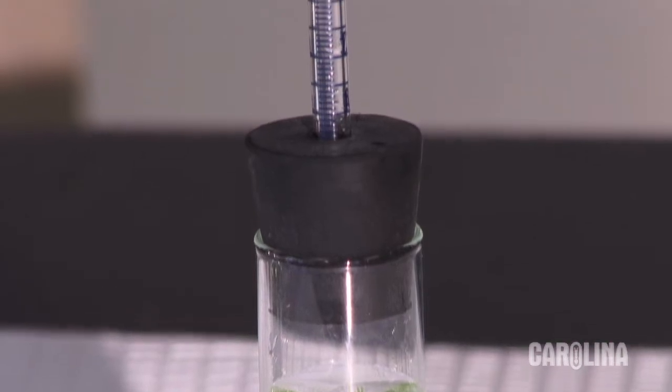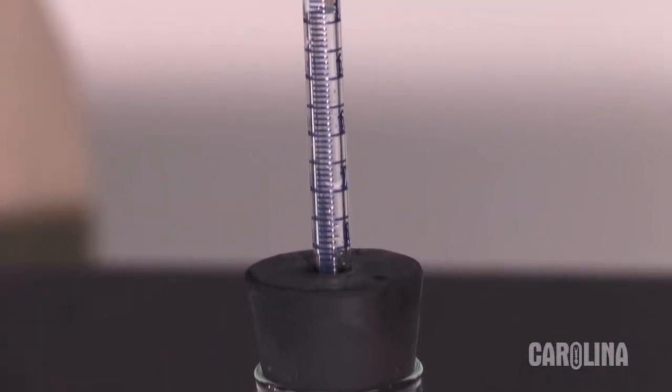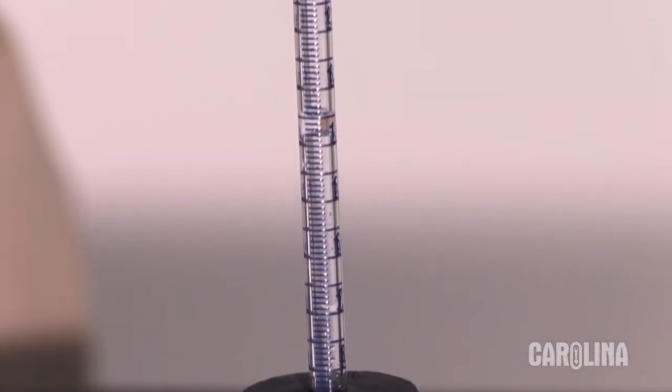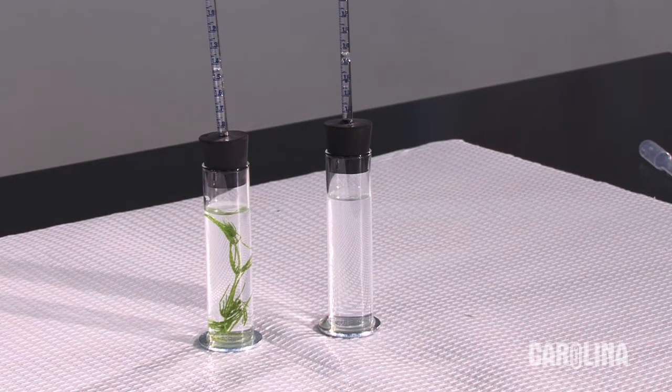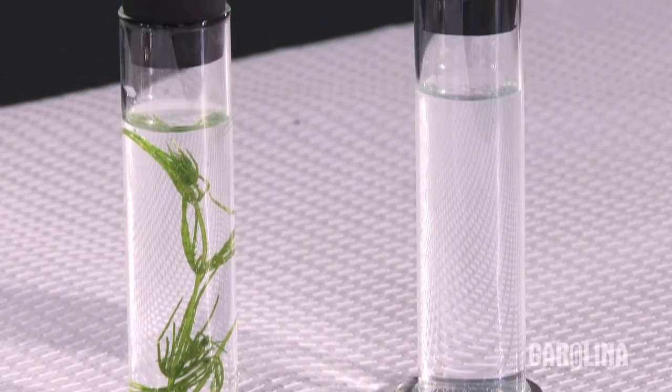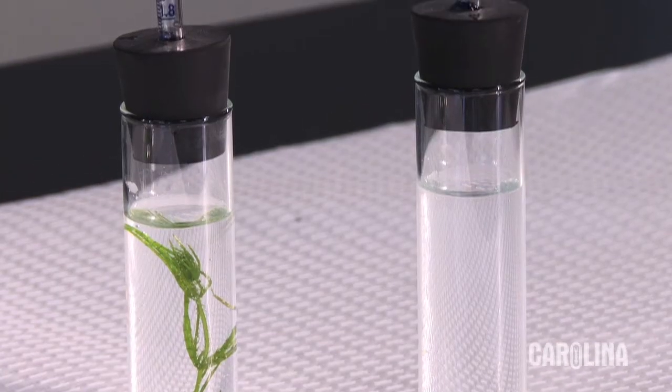This forces an air bubble up the pipette. Wait a few seconds to be certain there's no leak. As oxygen is produced, the bubble rises in the pipette. This system is temperature sensitive, so set up a second tube without a plant as a control. Any change in the control is used to correct the reading for oxygen production.